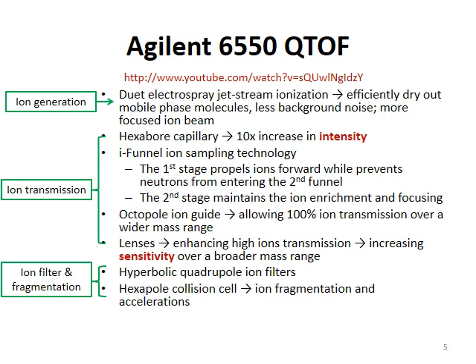Before you actually read on the words, I would advise you to watch this video on YouTube. This might give you some better idea how the function of each part and how the better design contribute to the high sensitivity and also high mass accuracy.